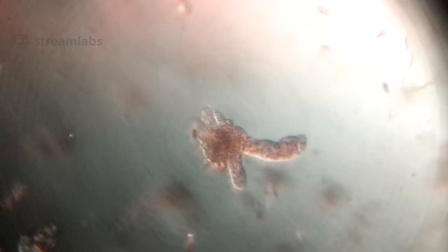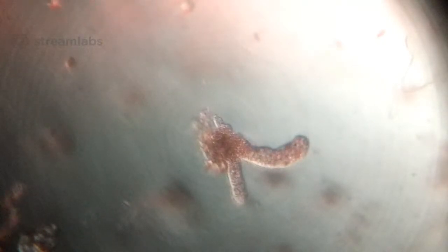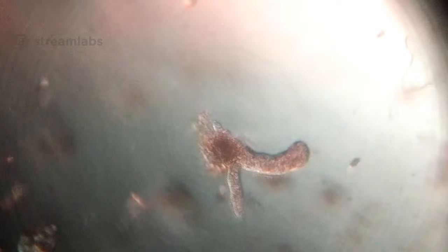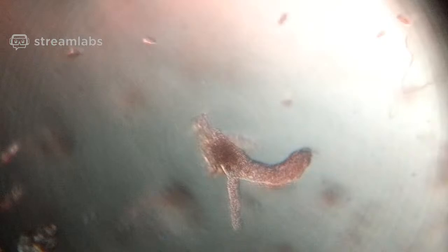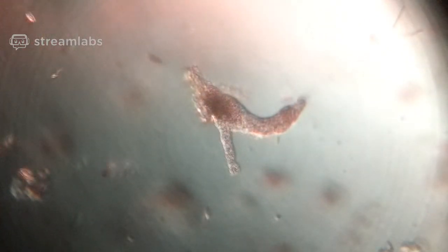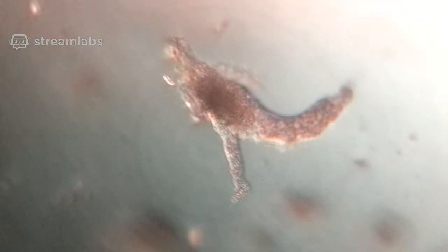And a lot of life forms just look like this. In fact, there are some organisms that are very close to animals that just look like this, but are very close to the animals compared to the amoebozoa. And wow, let's just stare at it for a second. You can see cytoplasmic processes in them.